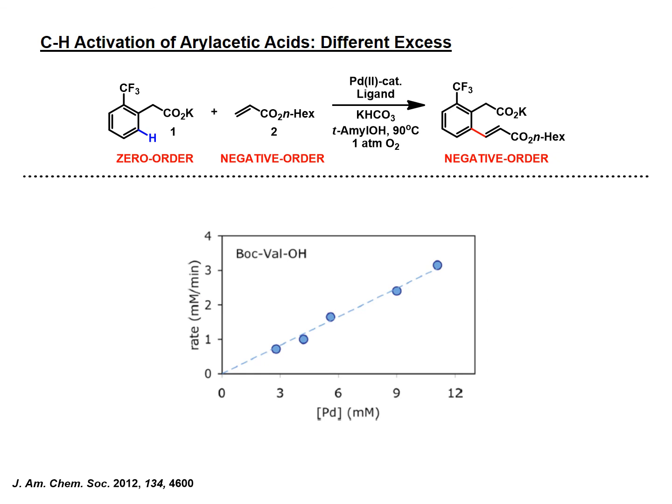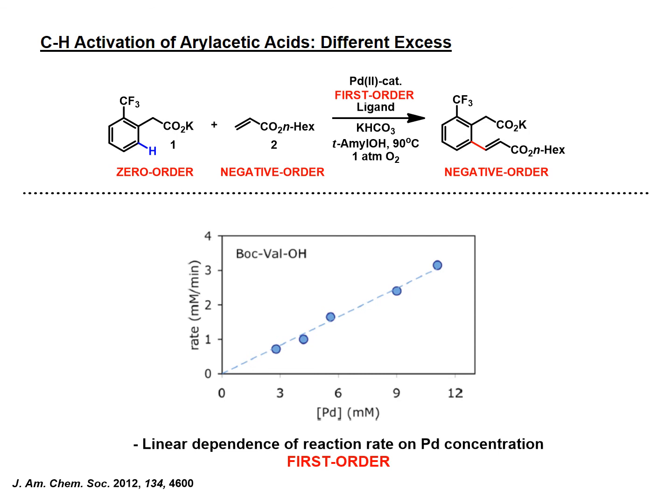So you have to go to the catalyst to find a positive driving force in this reaction, and you can do this via initial rates if you really want to, but you can do it with the full reaction progressions and just compare the full reaction progression of one at low concentration to higher concentrations and see that, yes, it gets faster. There's at least a positive rate dependence on the catalyst. So we have approximately a first order rate dependence. You can just call it positive if you want because it's not perfectly first order.